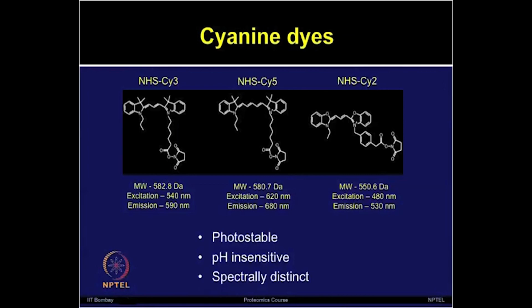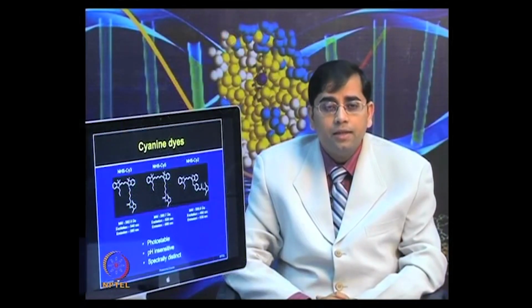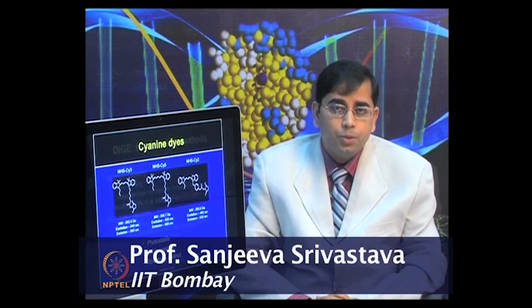The Cy3 excitation wavelength is at 540 nanometers, with emission at 590 nanometers. The Cy5 excitation is at 620 nanometers and emission at 680 nanometers. The Cy2 excitation is at 480 nanometers and emission at 530 nanometers. These dyes are photostable, pH insensitive and spectrally distinct. By using these dyes, the DIGE method can be used.